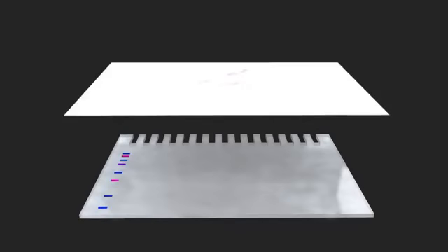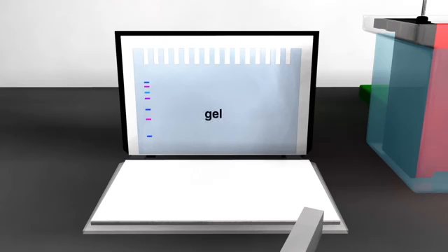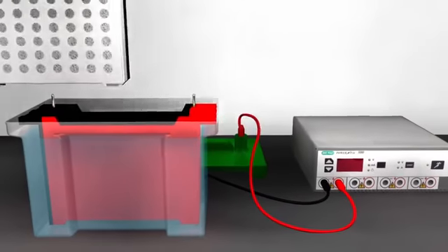The transfer method most commonly used in Western blotting is electroelution, where an electric field is applied to the gel to facilitate the migration of the proteins out of the gel and onto a piece of membrane. Transfer is accomplished by placing the polyacrylamide gel in direct contact with a membrane made of nitrocellulose or another non-reactive material that binds to proteins and submerging both in a buffer-filled chamber.